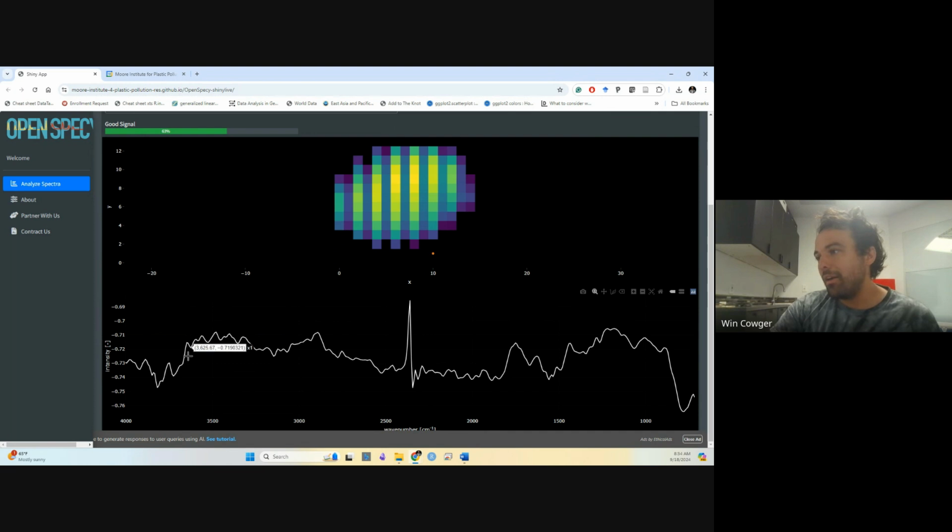Another thing to think about is how noisy the spectra is. When we're thinking about the noisiness of the spectra, we're looking for very tight undulations, tiny sharp peaks, and how high those are relative to the real peaks. So here, I know this because of these spectra, but peaks are not usually this sharp and this tight together.